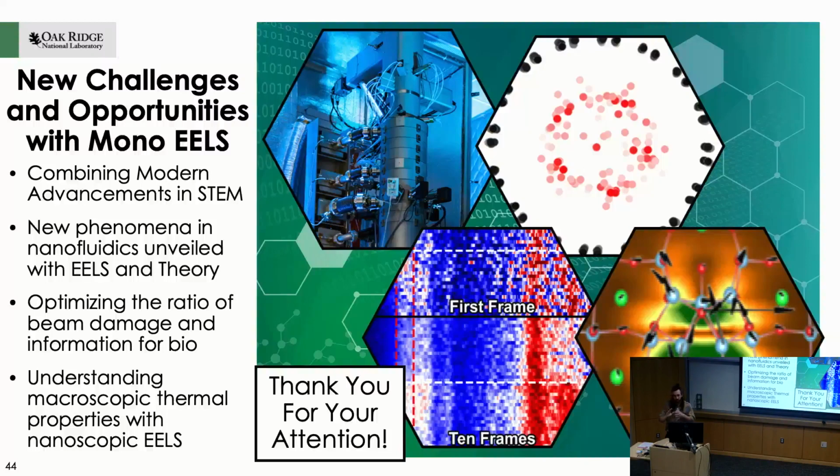So I think you could do systematic studies. You could do parameter sweeps. You could do all of these things to be careful and deliver foundational scientific studies to this system and really learn a lot. We've done the initial measurements, and I presented to you most of what we've figured out from the experiments we've done, but I think more measurements would be tremendous. And definitely, I think new fluids would be a great thing to look at. And also different types of encapsulation, right? Like intercalated materials, buckyballs, zero-dimensional encapsulation. Why not?